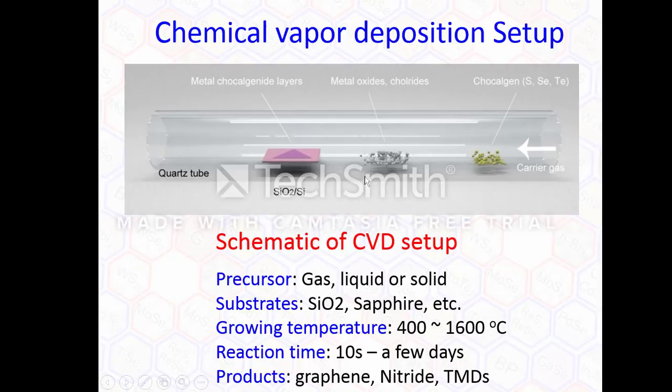We just put them here. At the center of the tube we put our substrate, all kinds of substrate: silicon oxide, quartz, whatever can resist high temperature.